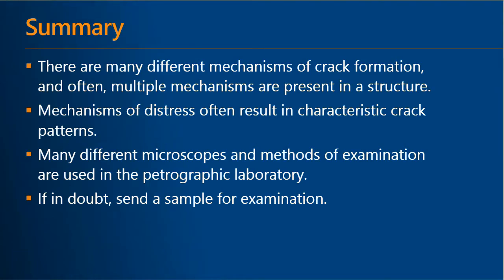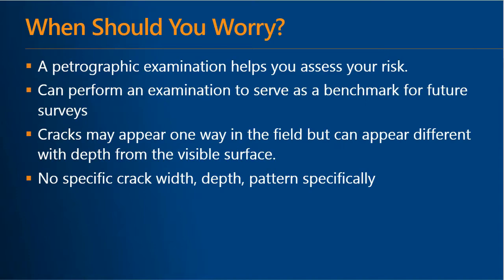Again, as Daniela showed, we use a lot of different microscopes. We have chemical testing, we have different lighting conditions, all that we use as part of our examinations. And sometimes it's a quick answer, and sometimes it can take a lot of testing to try to determine that cause. However, if in doubt, feel free to send a sample for examination.